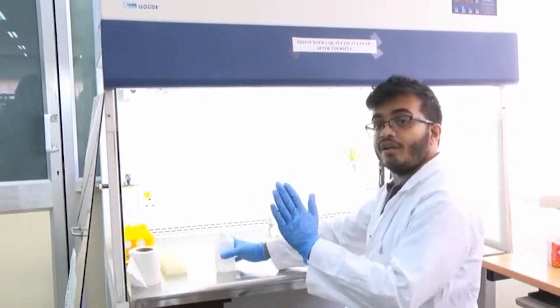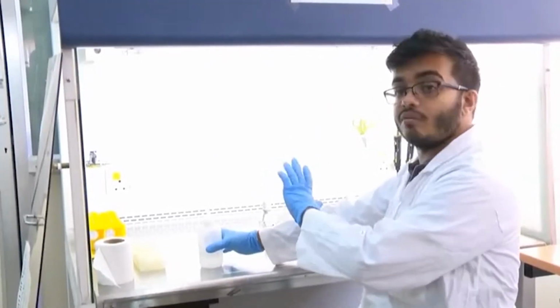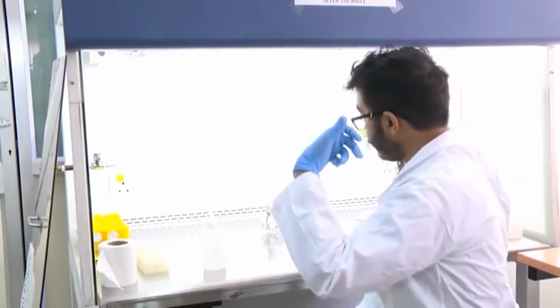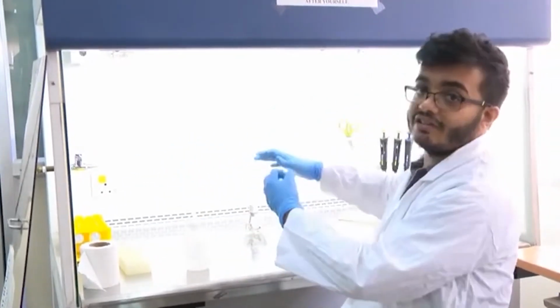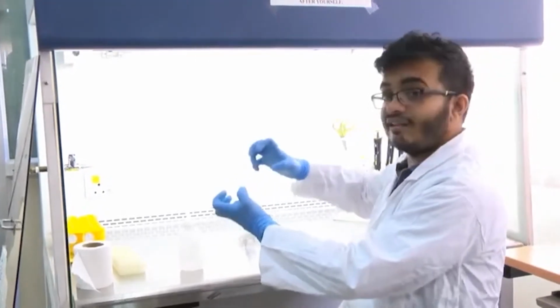Remember, during normal experimental procedure, you should not talk too much while working in the laminar airflow, because you do not want to forcefully spit into this and contaminate the entire place. However, for this demonstration I have to talk, so I am talking, but do not learn this portion.